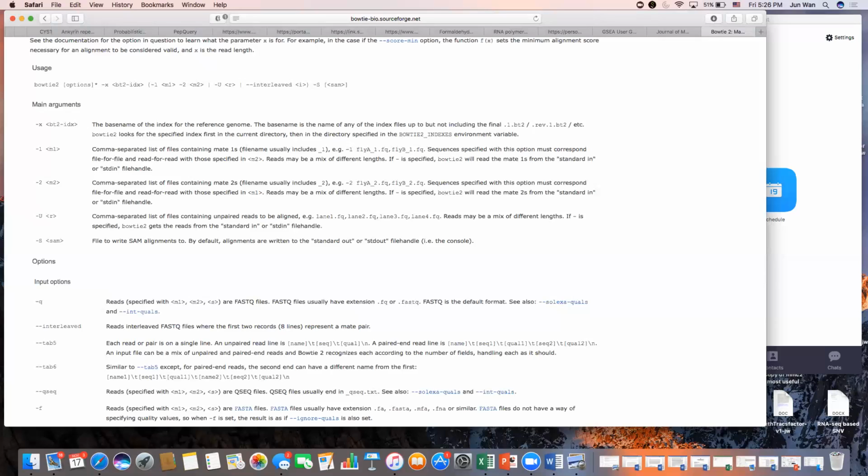Any more questions on Bowtie 2? Anything at all? And like I said, I don't have a shell where I'd be running this in front of you. My office is on the 5th floor of this building. I welcome every one of you to come sit with me in the office. We'll run this command. I'll show you how quick it runs, and I'll show you how to get through this homework. Because in my opinion, you need to understand ChIP-seq. You need to see the results that you get back, but you also have a final coming up. You have a project coming up. You have other classes. I want this to be a very efficient, very enjoyable homework assignment for you. That's why you have one control and you have one treatment, okay?